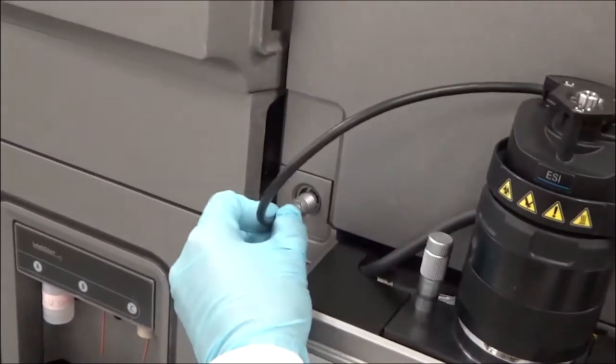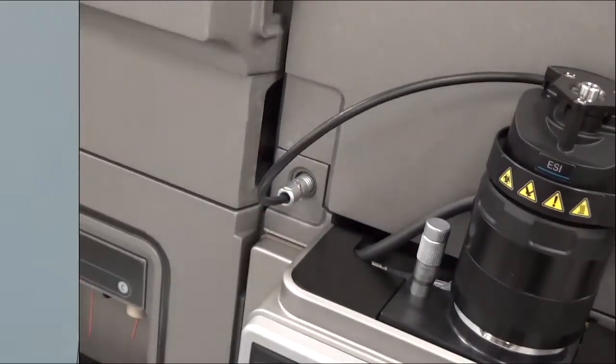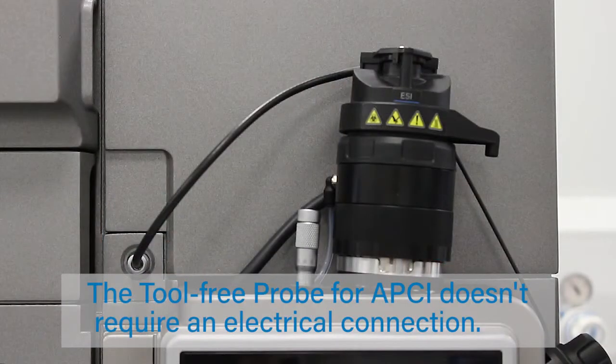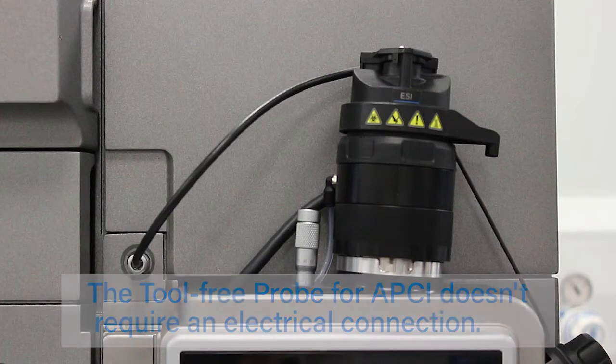Connect the probe adapter's cable to the high voltage connector. The capillary is housed in a protective outer PEEK tubing sleeve, referred to as the probe assembly. Note that the tool-free APCI probe does not require an electrical connection.